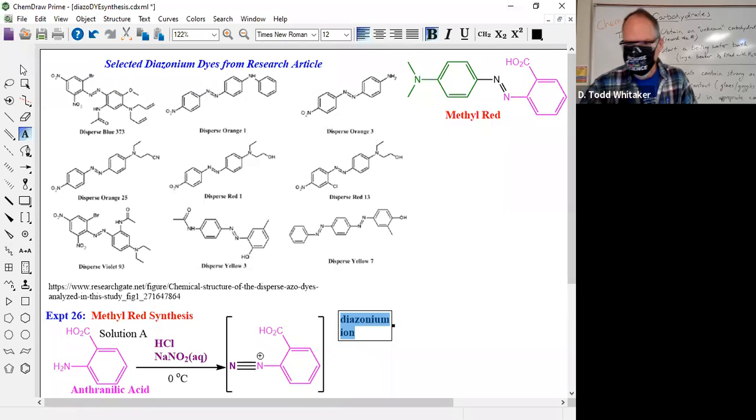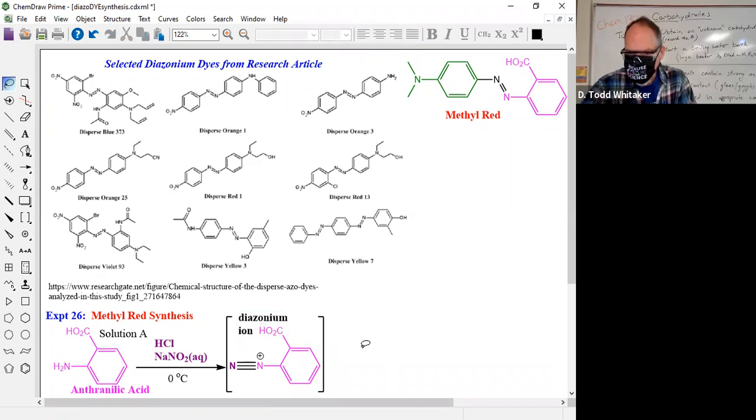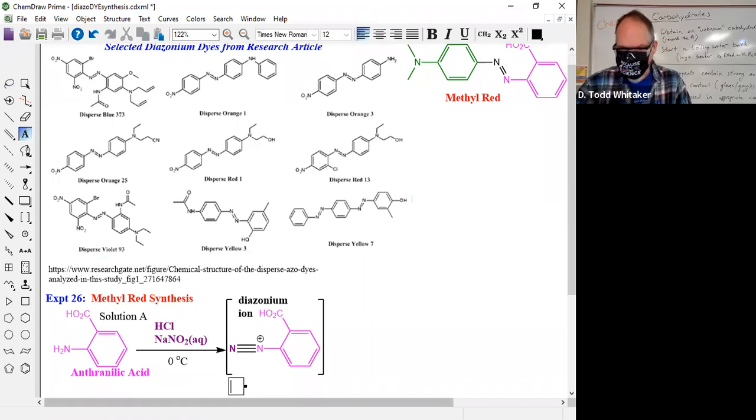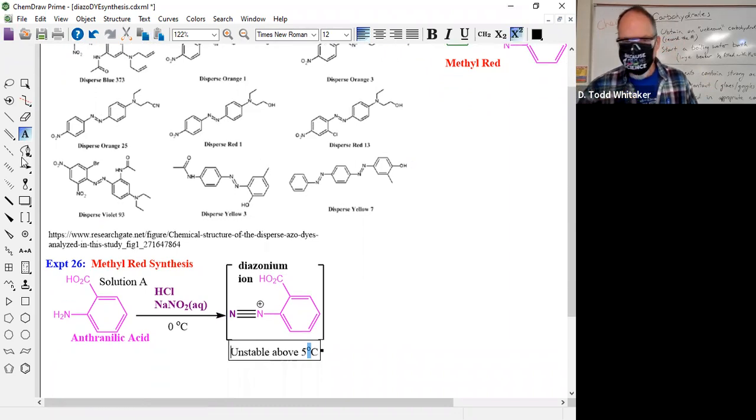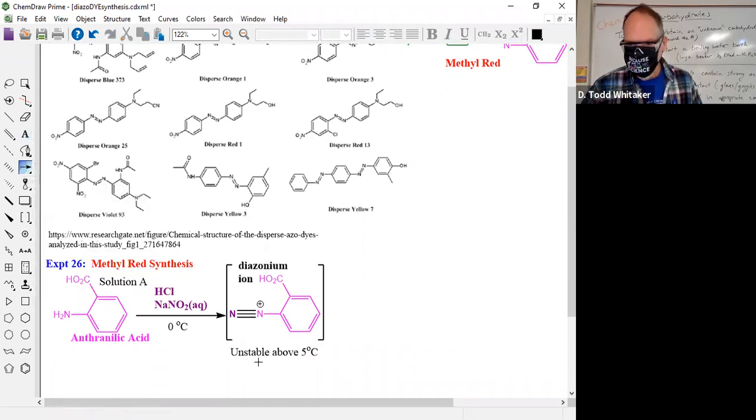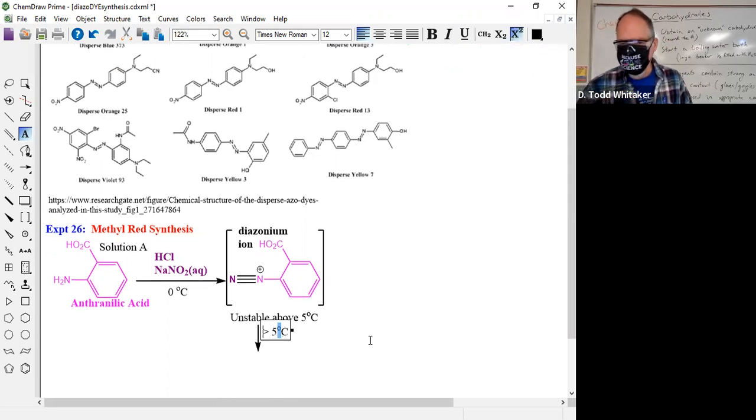2 nitrogens, diazonium ion. Unstable above 5 degrees Celsius. Five degrees Celsius. You want to see what happens above 5 degrees Celsius? It's sad news. There'll be a lot of crying. Yes, among other things. Yeah, he said the N falls off. Yeah, it gets hydrolyzed off.